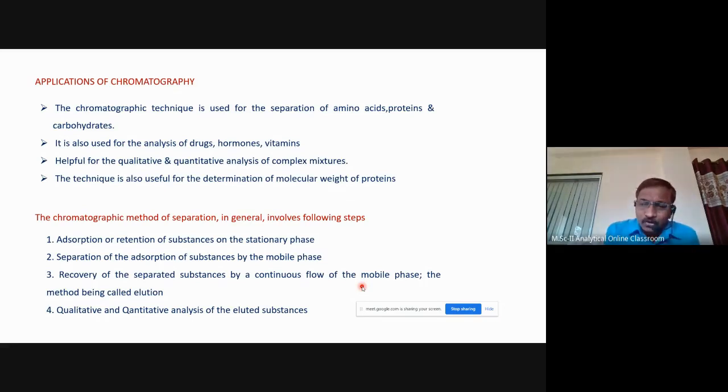No doubt it requires more solvent for separation, because I have carried out column chromatography in my research. Almost all samples I prepared were purified by column chromatography, because that was required for biological activity, mostly anti-cancer and anti-tubercular. When I observed, even though the sample appeared pure on TLC, there is a possibility that we have obtained some isomers which are not observed on TLC.